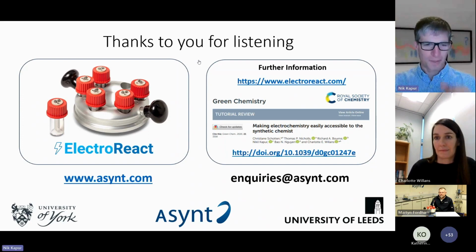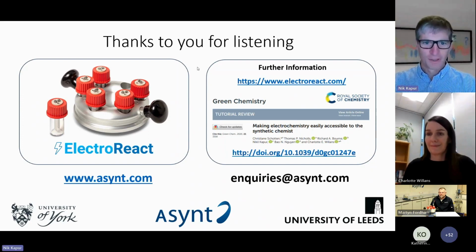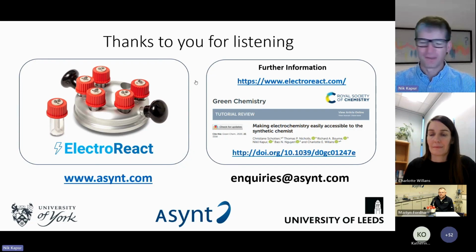I can perhaps answer from an electronic perspective. So the power packs would typically have a maximum voltage of 30 volts DC. So that's not high enough to cause significant risk of electrocution. I'm not going to say no risk of electrocution, but it's the sort of power pack we would use all the time in undergraduate teaching labs and those sorts of things without any real concerns or risks.